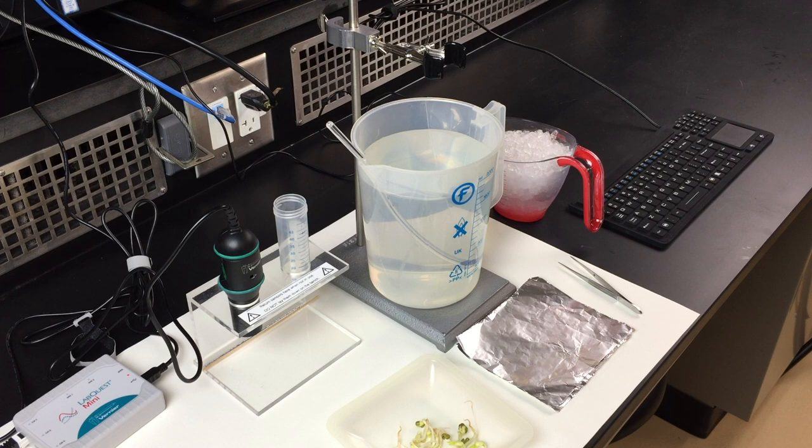Measure out approximately 4 grams of mung beans. It doesn't have to be exactly 4 grams. Record down the exact weight of your mung beans into your lab manual. You will need this value later on for the calculations of the metabolic rate.